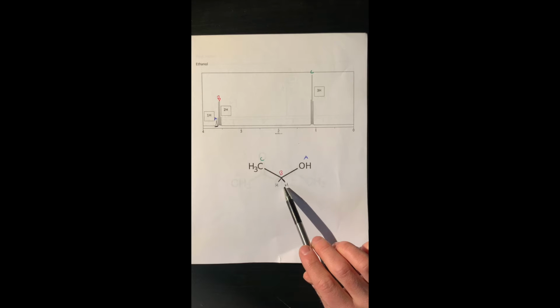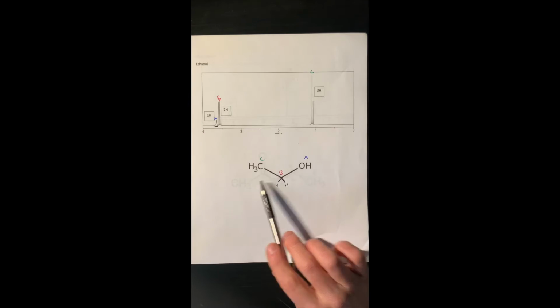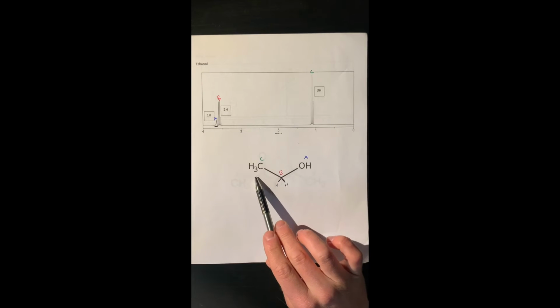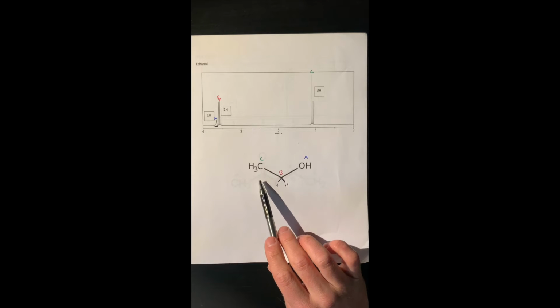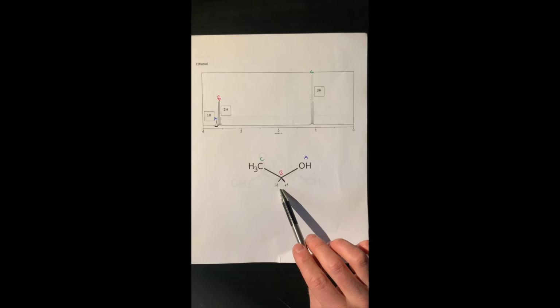And because of spin-spin coupling, this CH2 will have 4 signals and will be a quartet. This CH3 will have 3 signals and be a triplet. And this OH will have 1 signal. The 3 hydrogens on the CH3 at the end of the chain, furthest from the alcohol, will couple with the equivalent hydrogens in the middle and give off 3 signals. That's called a triplet, because you can see there's 1 tall peak and then 2 smaller peaks next to it. So 3 peaks is a triplet.